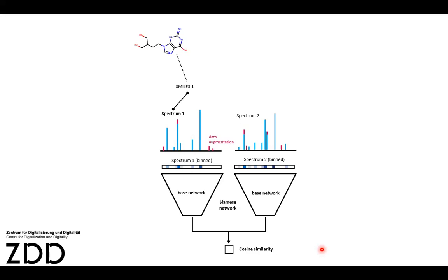We train it with spectra where we have annotations. In the scheme that we saw yesterday, these are mostly level 2 annotations. What we get when we download GNPS data has faulty annotations for sure. It's not a clear reference number like this, but we assume that these are the true labels for now. So we know that for these spectra we have SMILES or InChIs, and since we have SMILES or InChIs, we can also compute the true score, what we call the true score here in our conception.